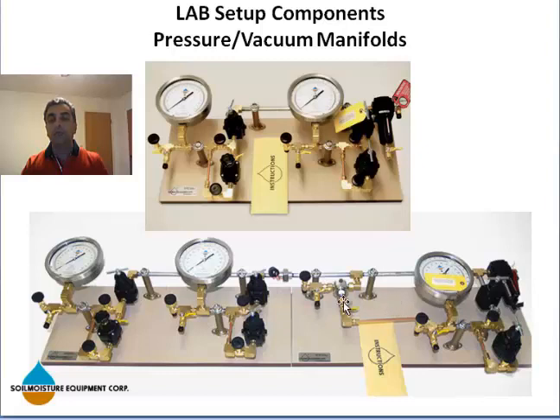Basically, you can order a station separately, but oftentimes people prefer to have them as a combined manifold. And if you buy a Lab 2-3, you get this one, and if you buy a Lab 1-2-3, you get this combined or combo manifold.